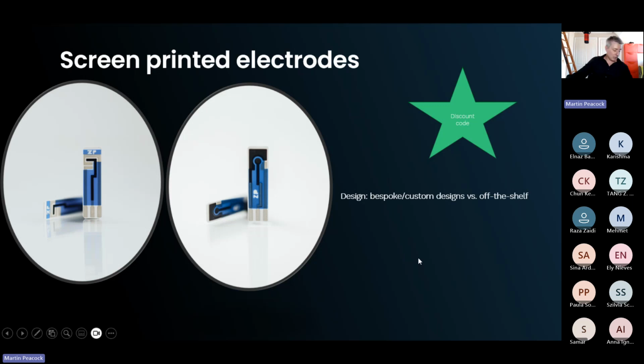Be very careful about bespokeness. I was doing a webinar the other day. So here's a sheet of electrodes. Here on this sheet, before I cut out a few of them in the corner, there were 300 electrodes. Now, the reason I hand that up is because people will often say to us, oh, well, I need a unique design. And I'll say, okay, how many do you need? And they say, I need 1,000. 1,000 would be 3 sheets of this. Well, that would be 900, but give or take 100. So you can understand that when you're asking for something bespoke and special to you, unless you've got large volumes, I could give you 1,000 or 900 in just 3 sheets.